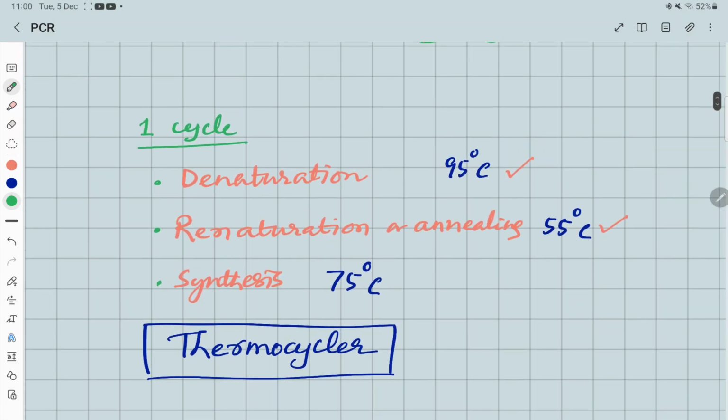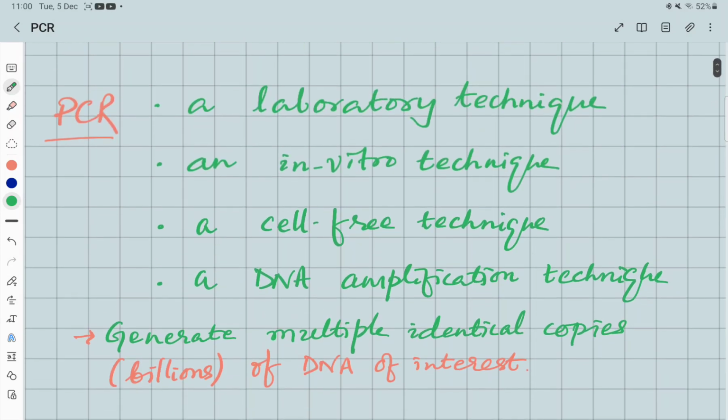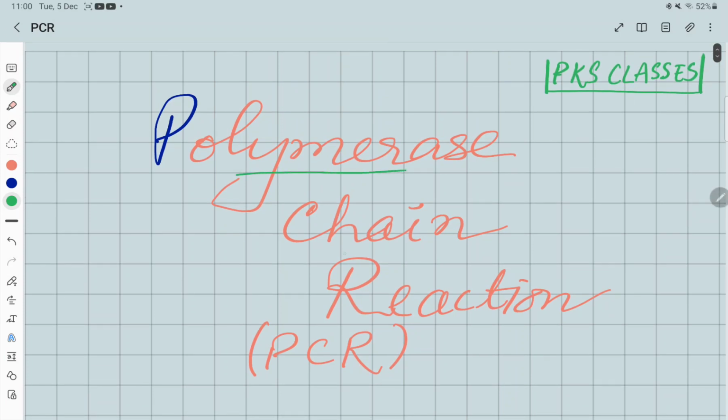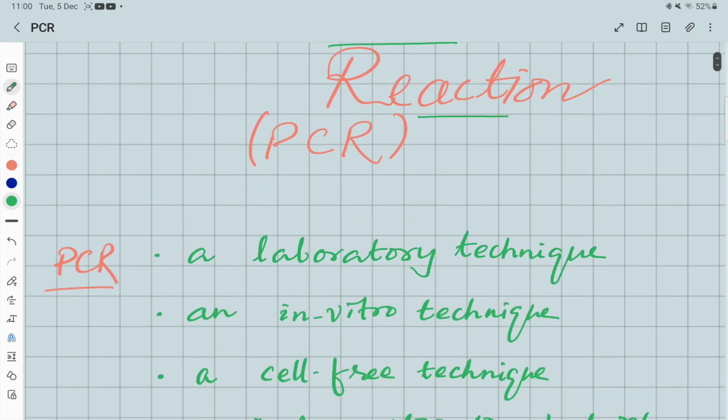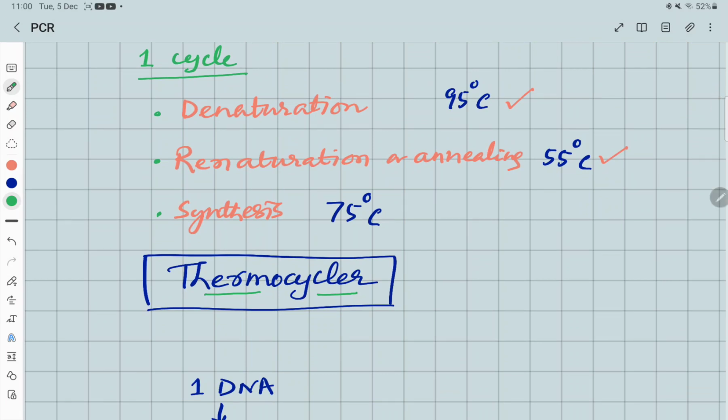Since this cycle of events, consisting of denaturation, renaturation and synthesis, occurs due to variations in the temperature, by increasing the temperature, then lowering the temperature, then increasing the temperature, we call it a thermocycler. So the PCR instrument is also known as thermocycler. Thermo for temperature, cycler, one after another the cycle is repeated. That's why we call this a chain reaction, polymerase chain reaction. Each cycle consists of 3 processes: denaturation, renaturation, and synthesis, and they are repeated one after another.